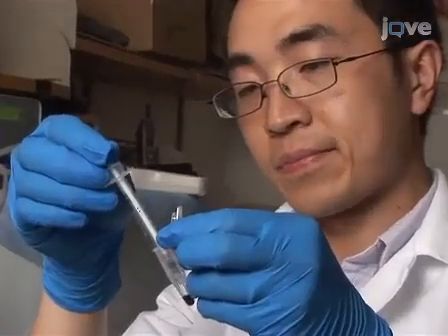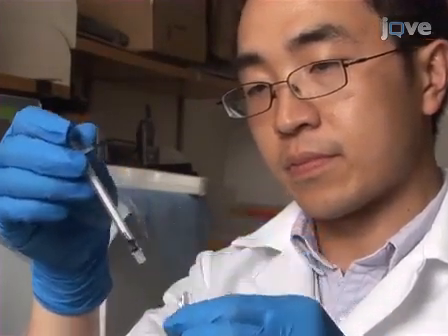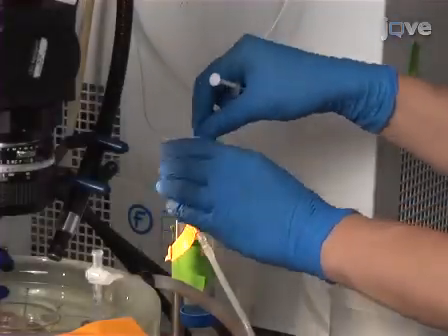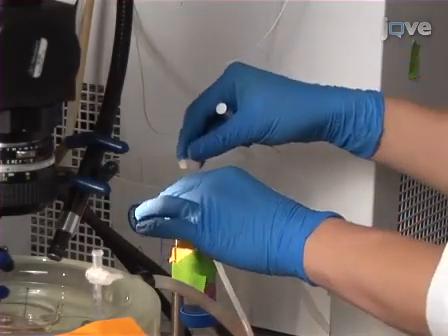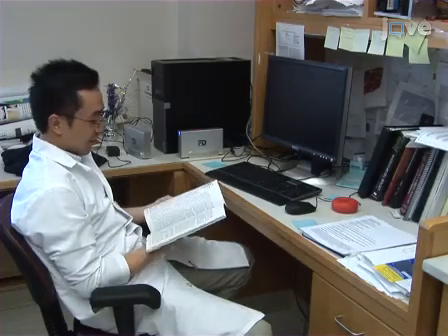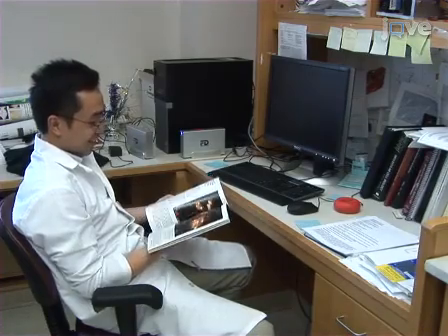Stain the heart by adding 10 to 20 microliters of voltage-sensitive dye RH237 through the injection port. Then add 200 microliters of Rhod-2 AM with Pluronic F127 in a 1-to-1 mixture through the bubble trap port. Wait approximately 20 minutes to allow the de-esterification of the Rhod-2 AM before mapping starts.